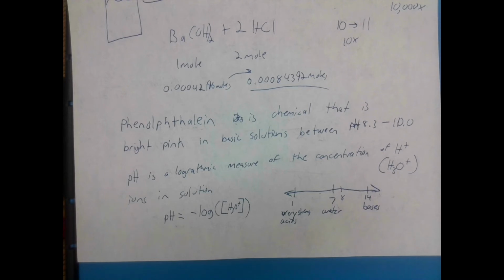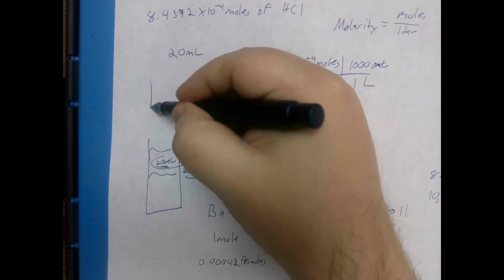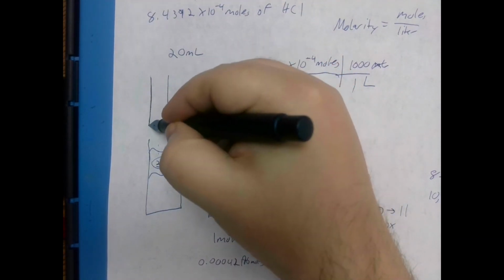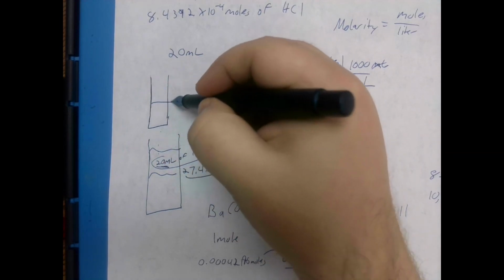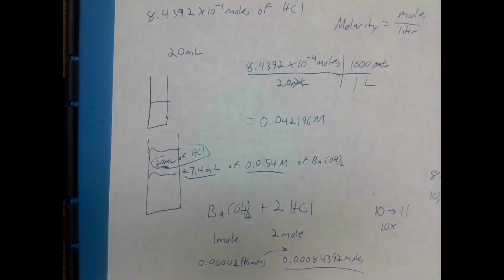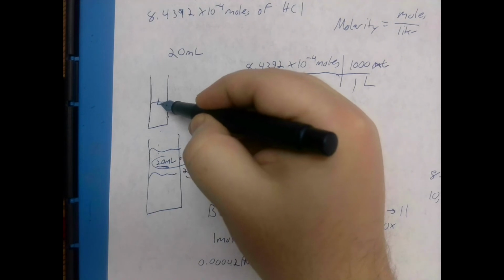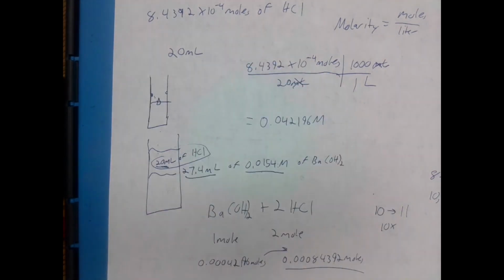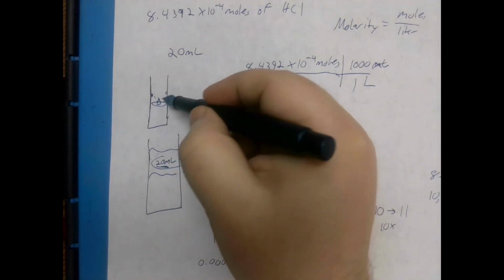And another thing: what happens when you try to pour a drop into something? What can occasionally happen? You drop a drop into it, and some little tiny bits cling to the side. And what happens when you swirl a solution?